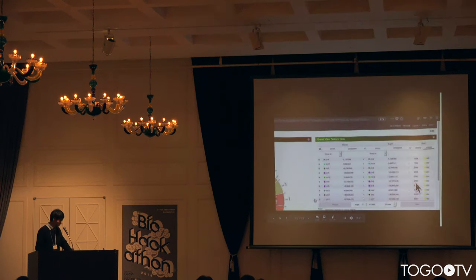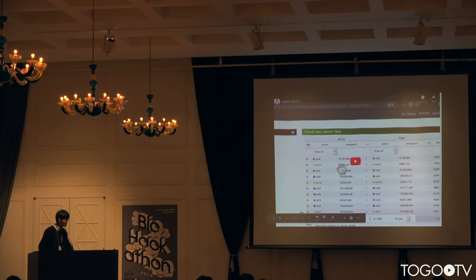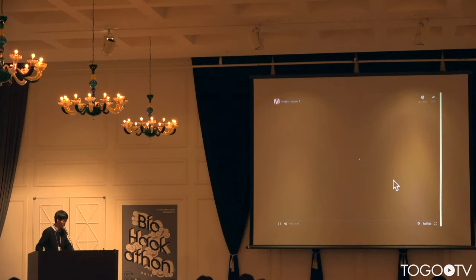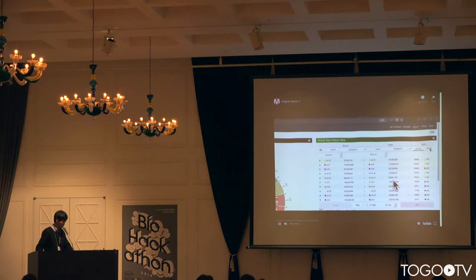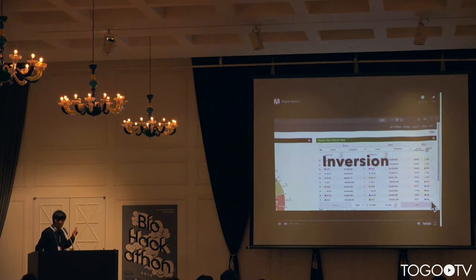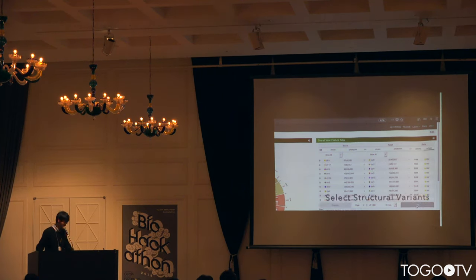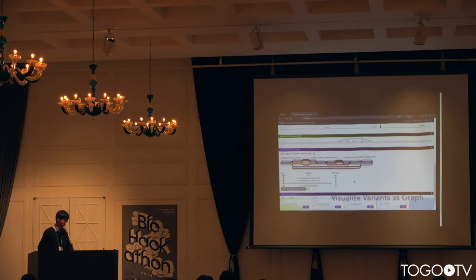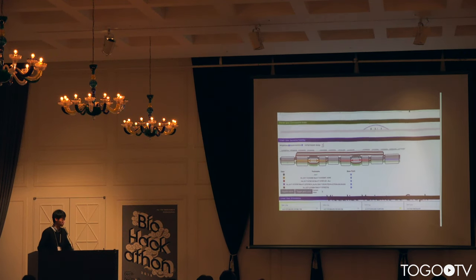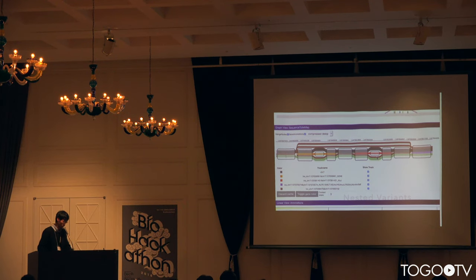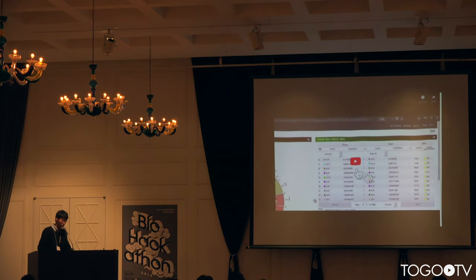In addition to the simple examples, I will explain the analysis workflow of Momiji. By selecting a variant from a list of SVs shown in this view, the whole picture of the variant is displayed on the graph view. This example describes a nested variant — a large brown inversion includes orange and red insertions. Such complex variants can also be visualized in Momiji.